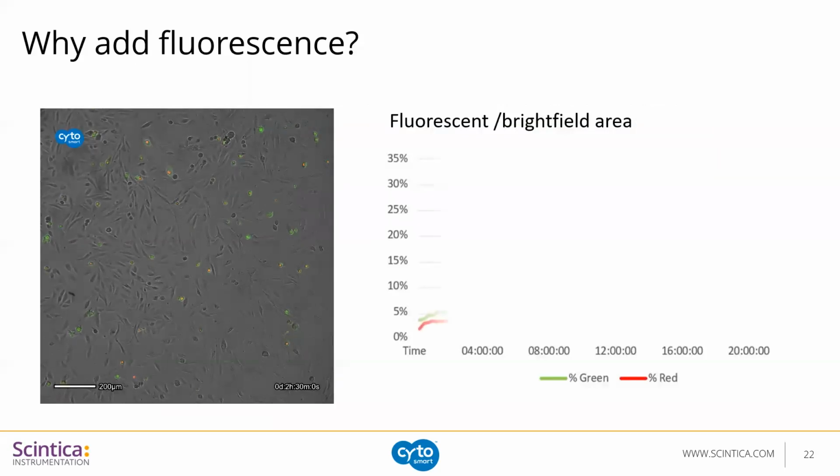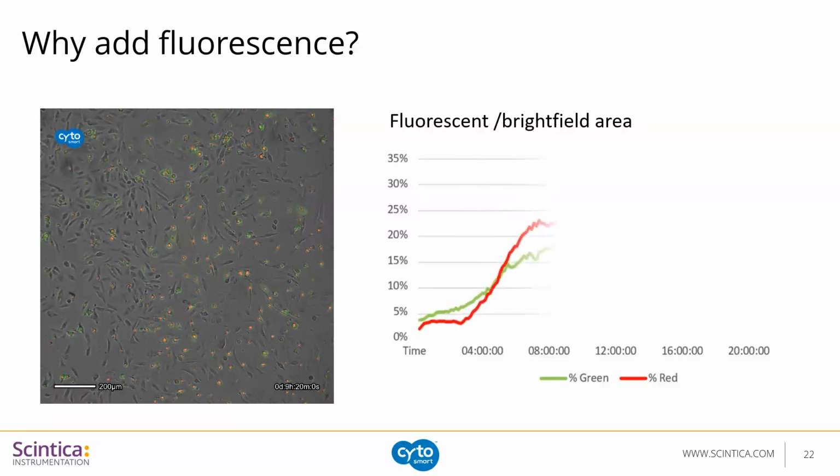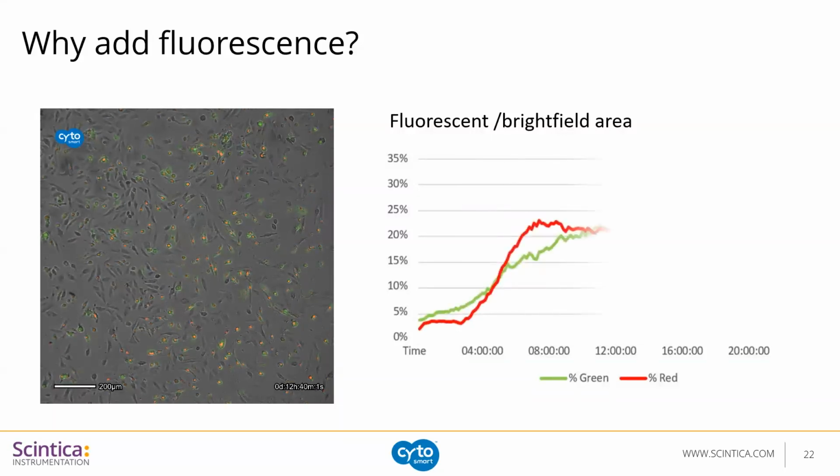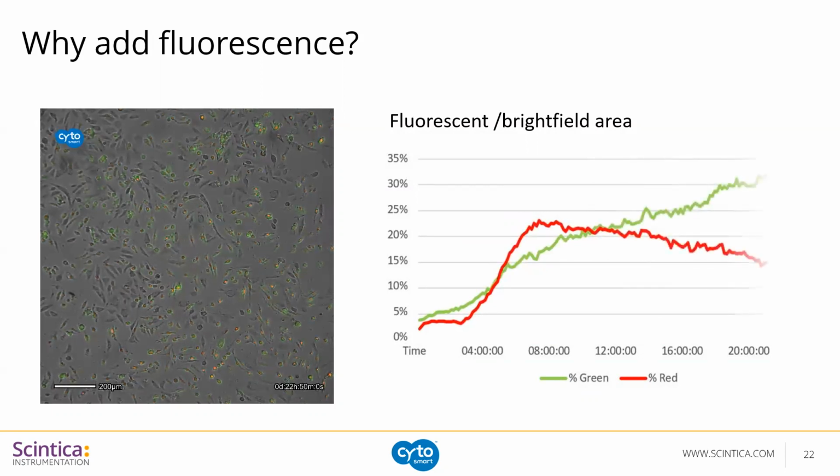Now, using the analysis software, you can actually get a measure of this over time to show the percentage of red cells versus green cells, or in this case, the amount of cells that are undergoing apoptosis versus the amount of cells that are dead. But you can, of course, design your experiment so that these fluorophores turn on or off depending on the cellular process that you are interested in studying.